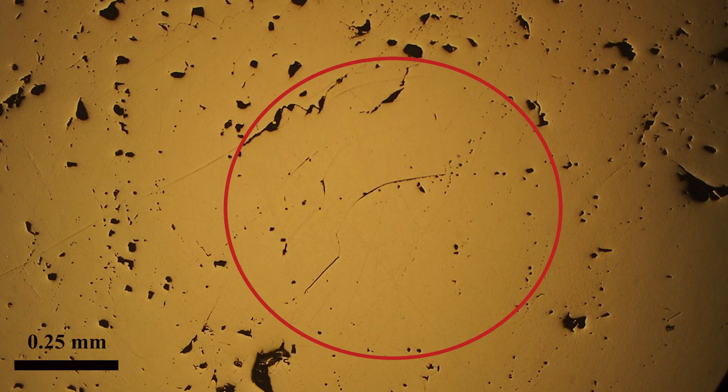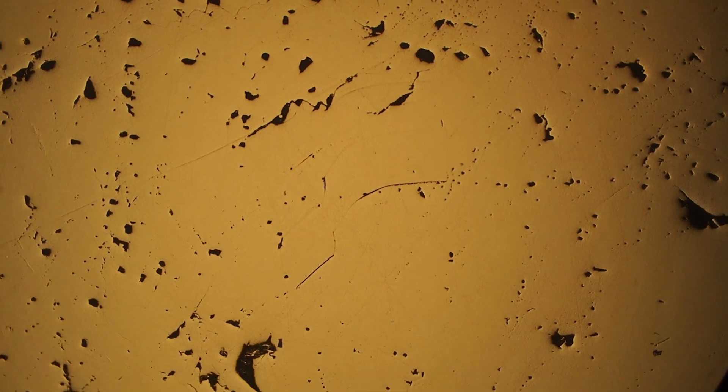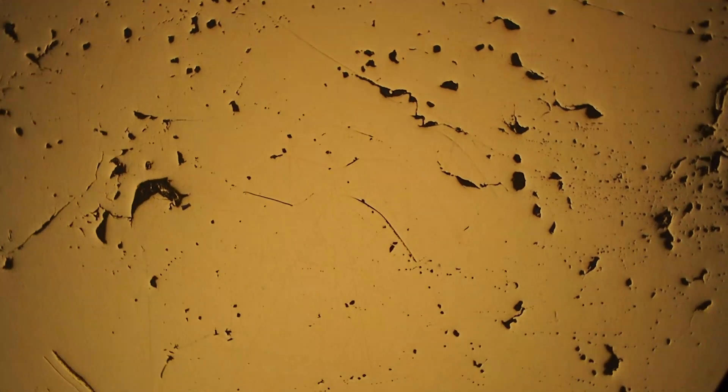All right, today we're going to talk about how to identify chalcopyrite in polished section. So this is chalcopyrite. It's quite soft and it's got this rich yellow color.